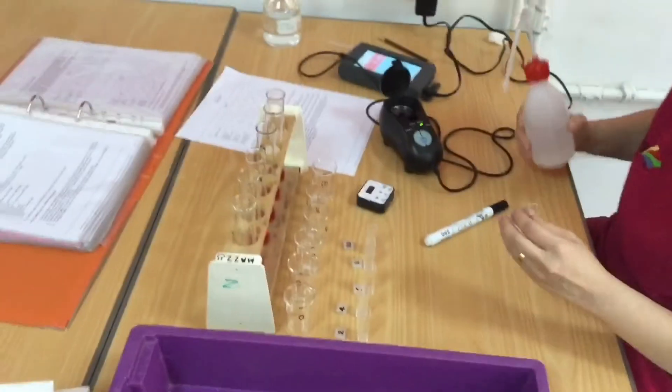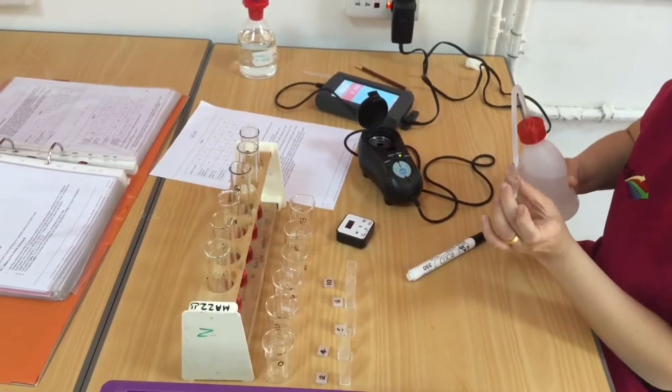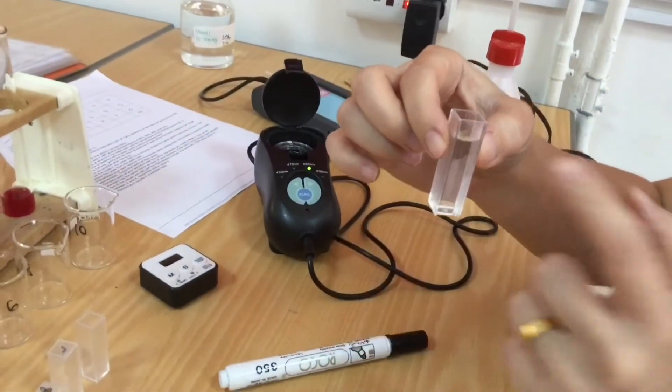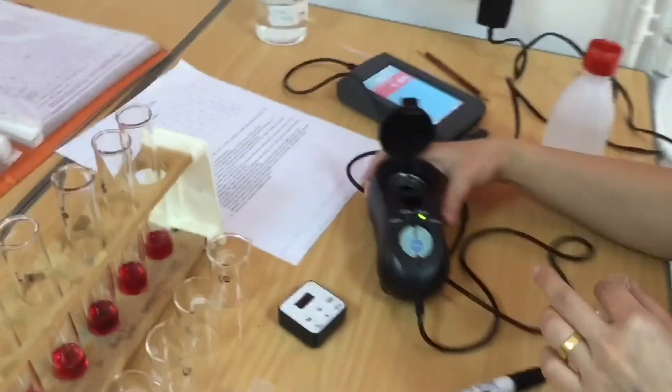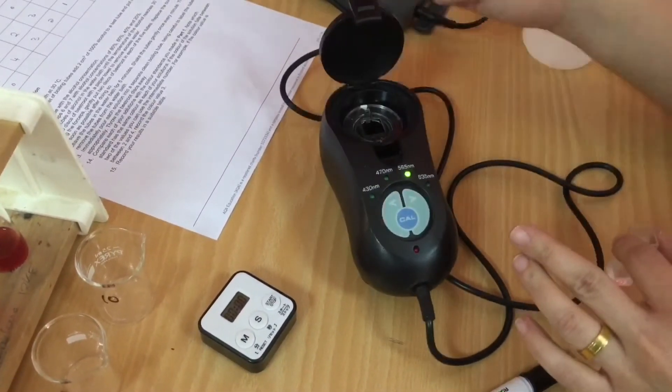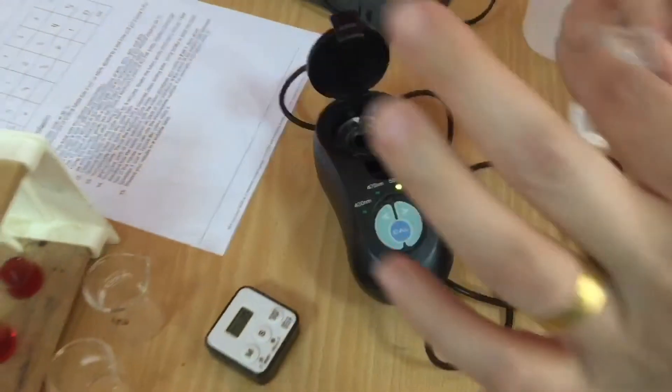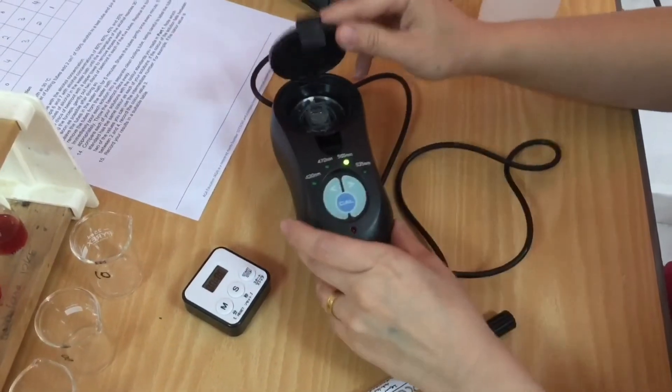The next thing to do is to calibrate the colorimeter. You can see now I'm pouring distilled water into the cuvette. The cuvette has got 2 smooth sides and 2 ribbed sides, and you're going to hold it on the ribbed side. You want to make sure that there's no fingerprints on the smooth side because that's going to change the absorbance. You can set the wavelength of light passing through it at 565 nanometres. The light shines through from the rear and you want it to go through the clear sides.